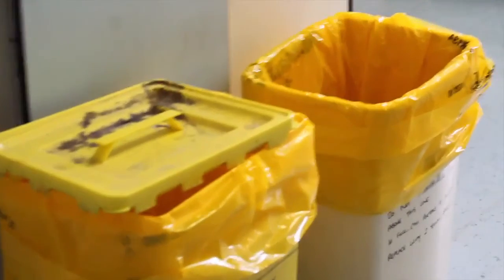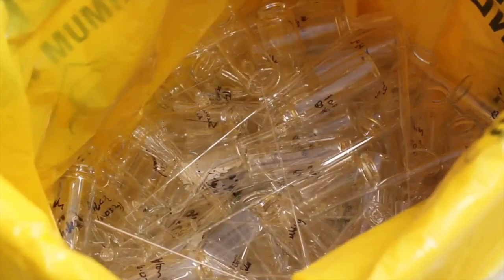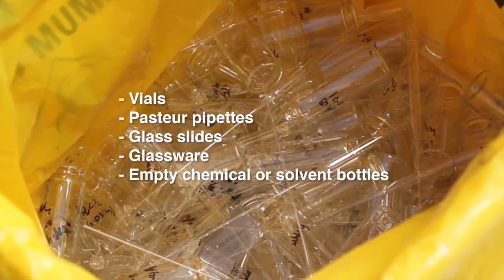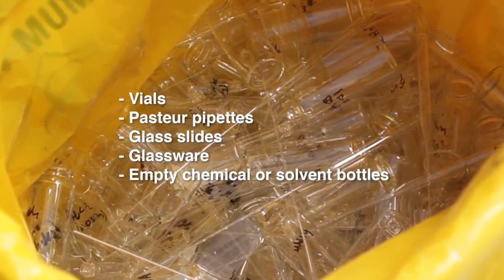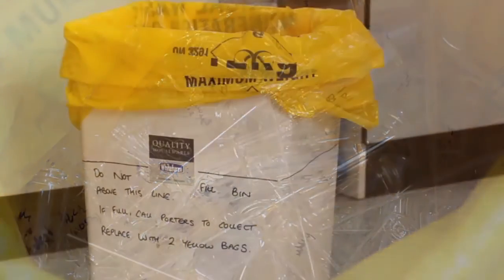The bins for broken glassware are the big yellow plastic containers and can be found evenly distributed around the lab. In here you can dispose of all the broken or contaminated glassware that you might come across during your lab work. These include empty vials, Pasteur pipettes, glass slides, or even larger items like beakers, conical flasks or round bottom flasks, and empty chemical or solvent bottles.